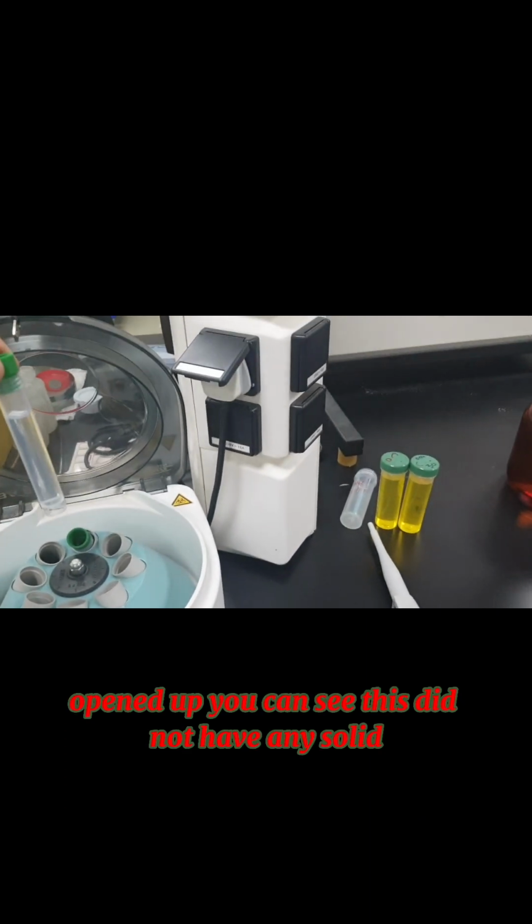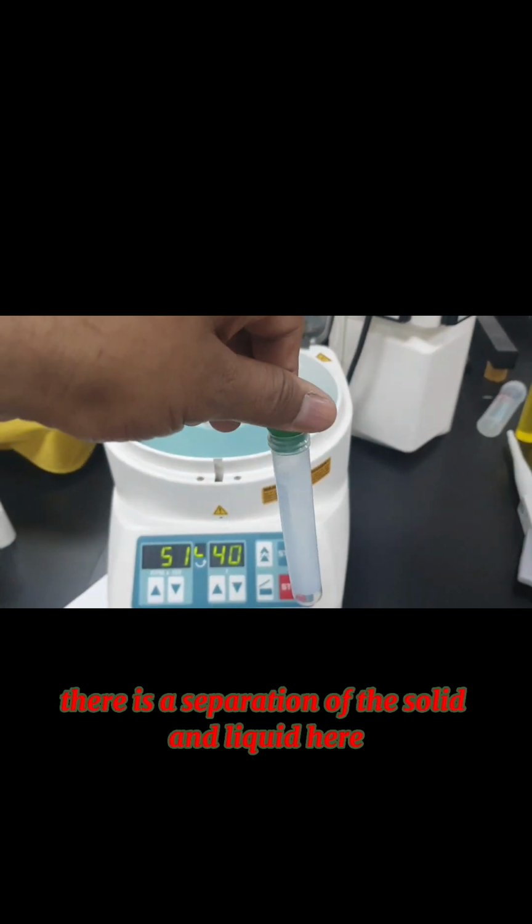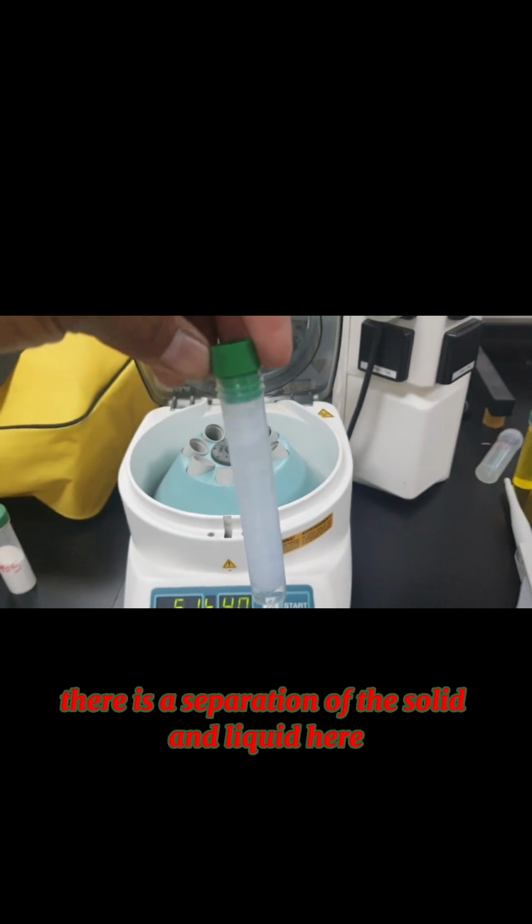After running for around 5 to 10 minutes, we opened it up, and you can see this did not have any solid, so you can see there is a separation of the solid and liquid here.